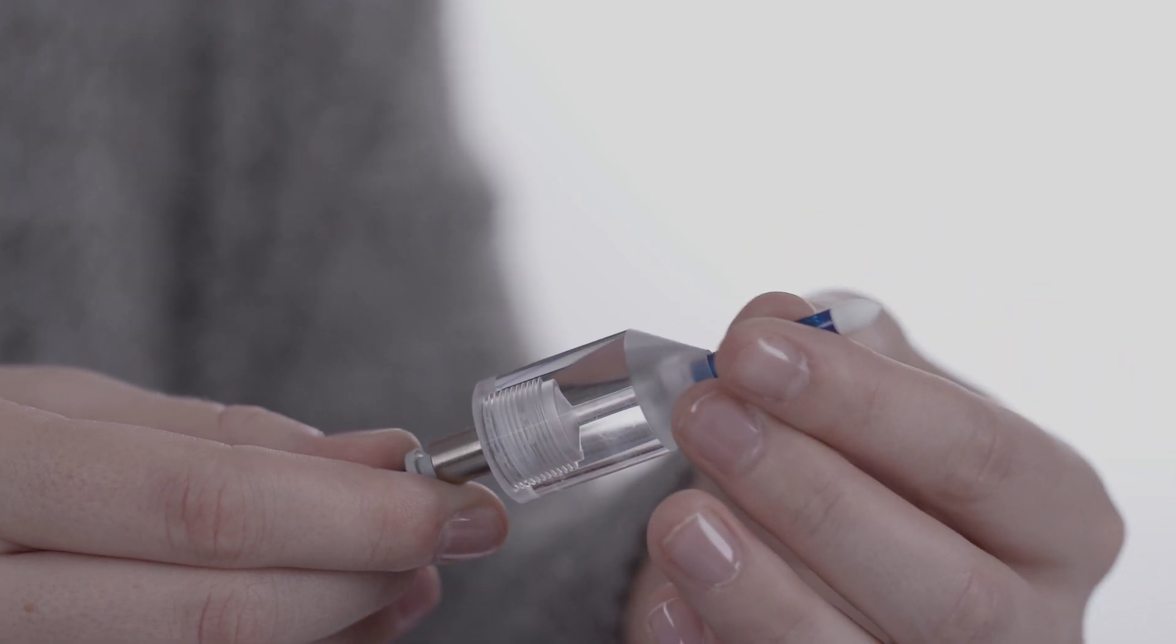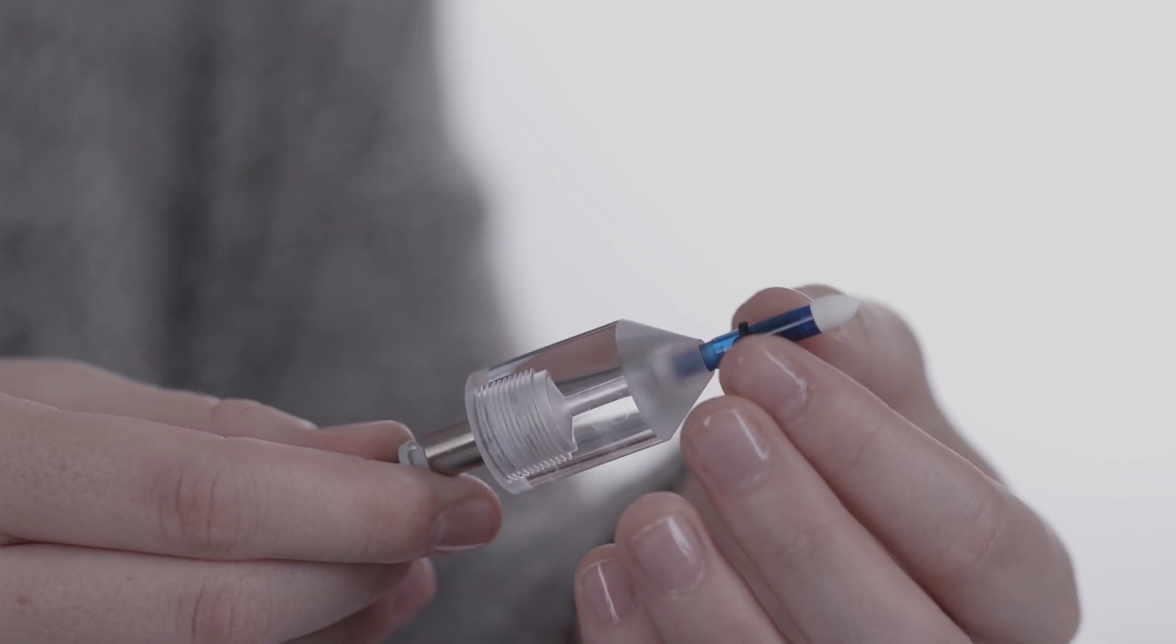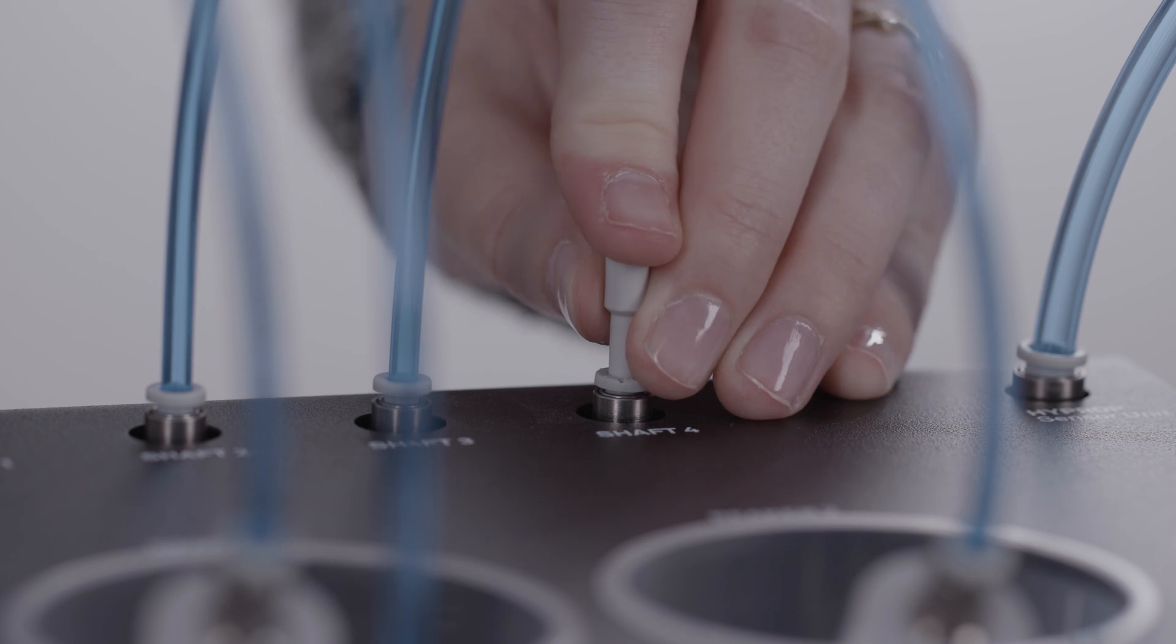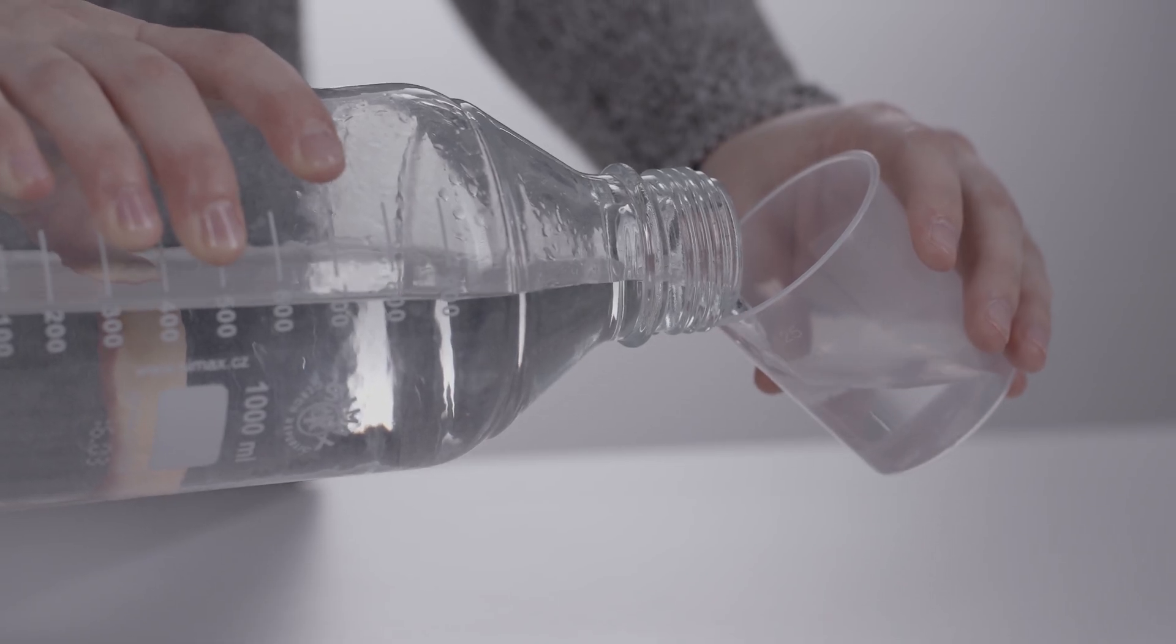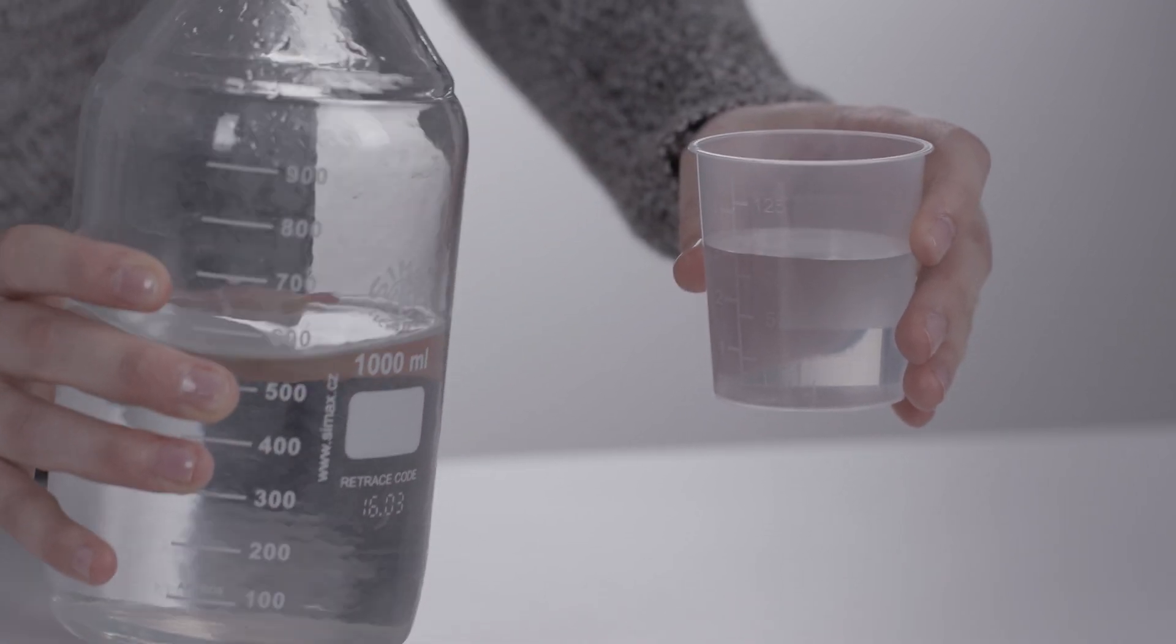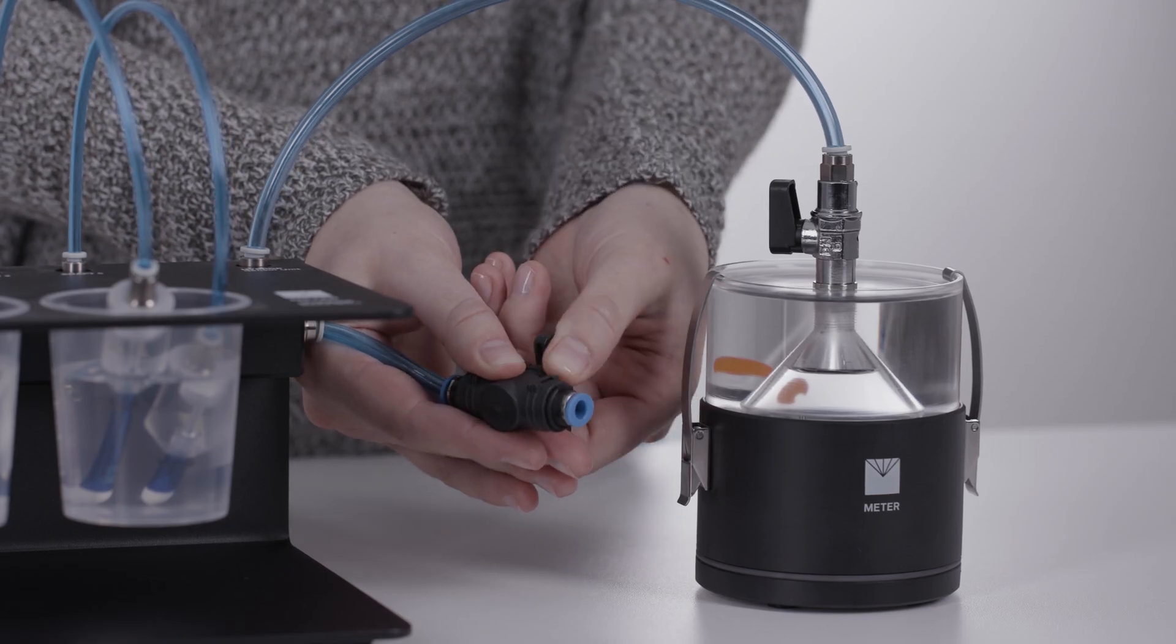Screw up to four tensio shafts into the adapters. Put blind plugs on unused connections. Fill the beaker or beakers with degassed deionized water. Close the valve of the beaker unit.